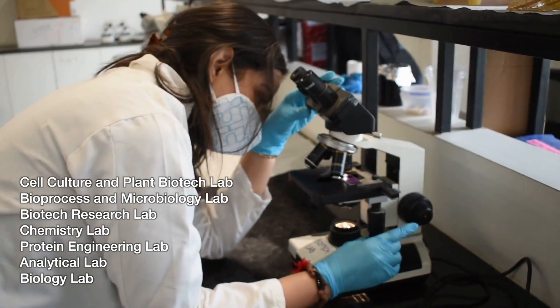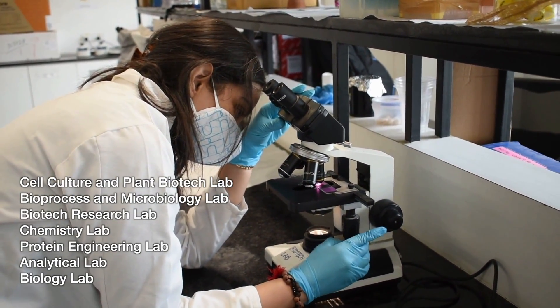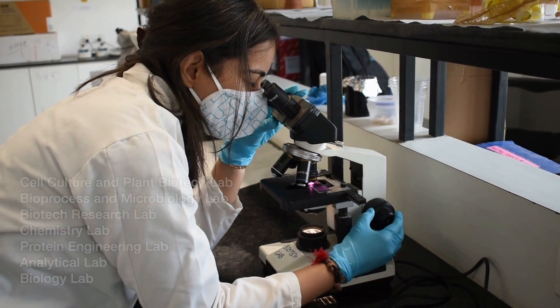Here at Bennett we have eight labs which deal with various research techniques and studying of various aspects of human, plant cells and tissues.